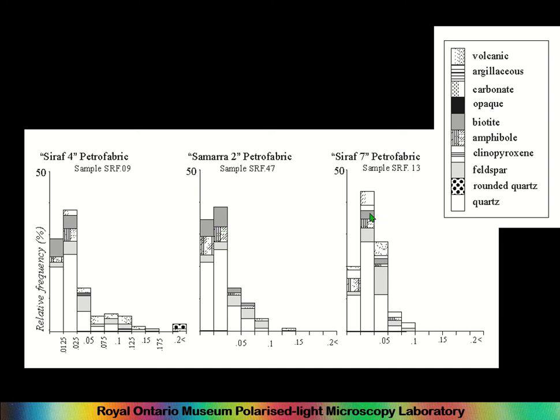Although, as I say, the mineralogy is not actually statistically reliable, although it is quite informative. But the grain size distribution has been shown to be valid.